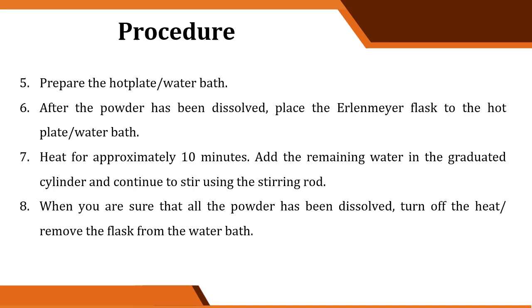minutes. So, add the remaining water in the graduated cylinder and continue to stir using the stirring rod. So, when you are sure that all the powder has been dissolved, turn off the heat or remove the flask from the water bath. Kung nakakita na kayo ng luluto ng gelatin, ganun lang din siya. Okay, so continuous lang ang stirring, tapos babantayan na hindi siya mag-boil over sa flask.